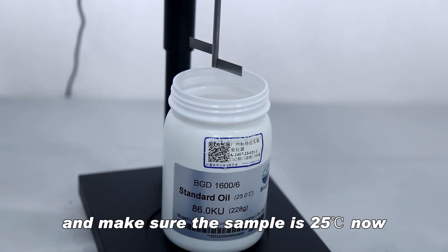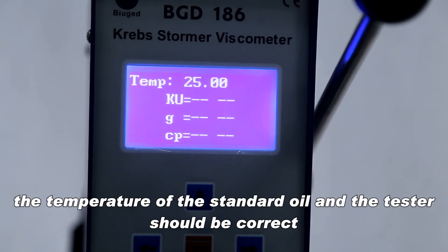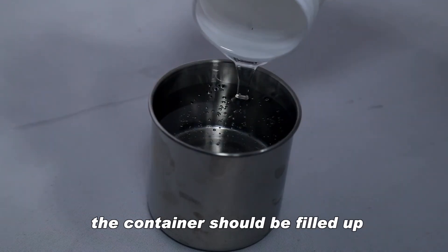Make sure the sample is 25 degrees Celsius. Temperature has a great influence on viscosity, so during the calibration process, the temperature of the standard oil in the tester should be correct. Pour the oil into the stainless container — the container should be filled up.